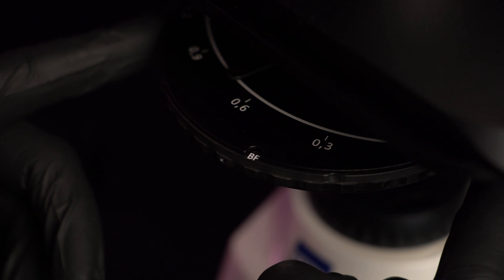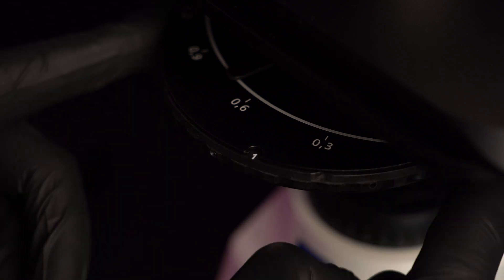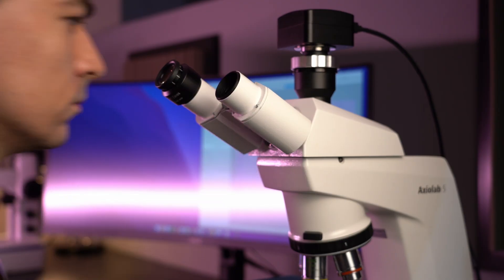Put the phase objective in the light path and install corresponding phase ring in the condenser. Remove the eyepiece or change it with a special telescope.